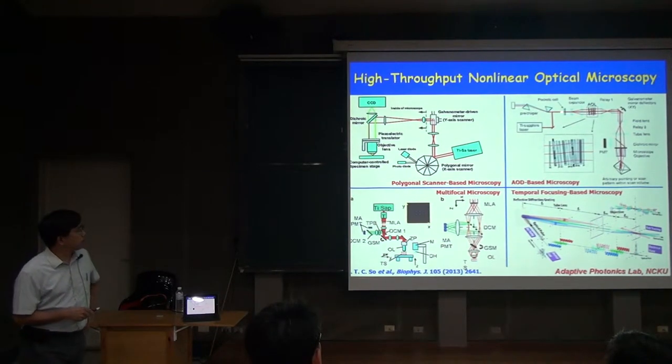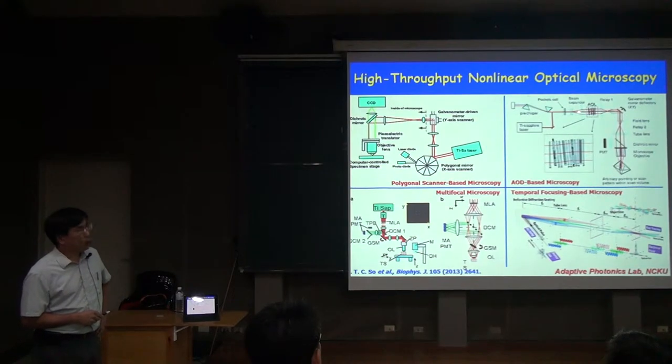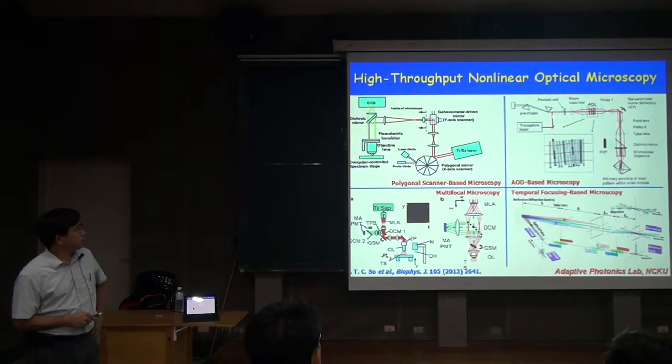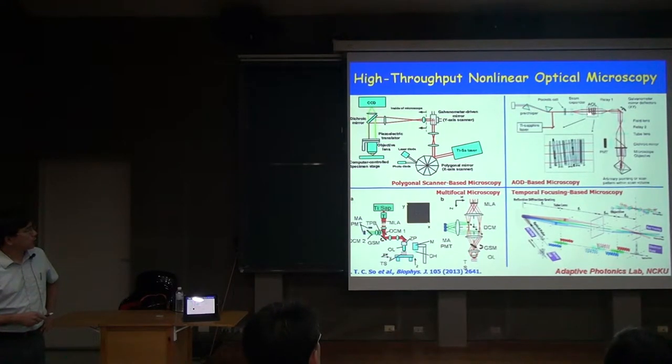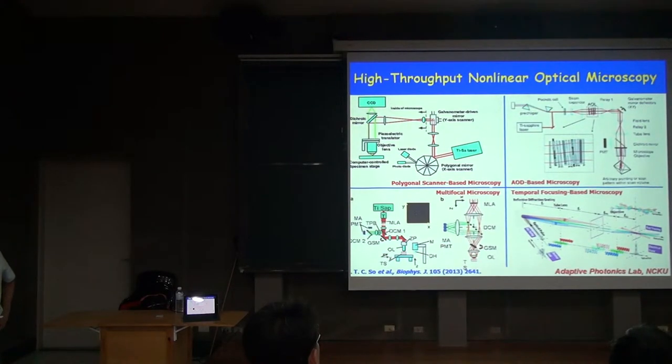And people also use an acousto-optic deflector, AOD, to diffract the light and scan your sample. Peter So from MIT used multi-focus.